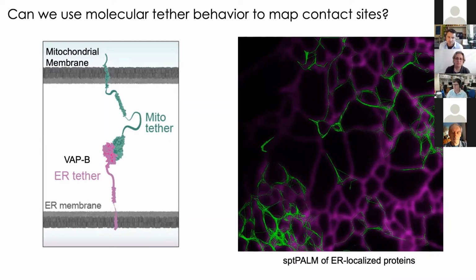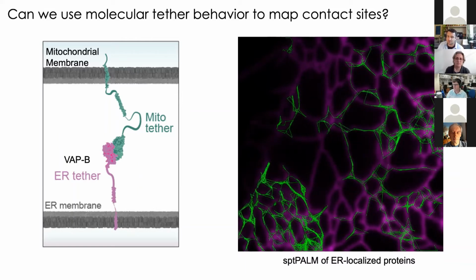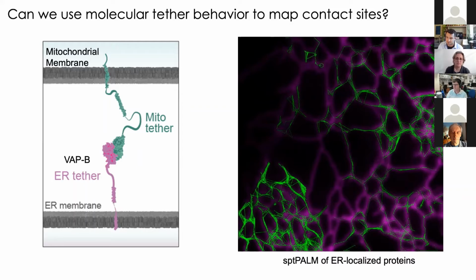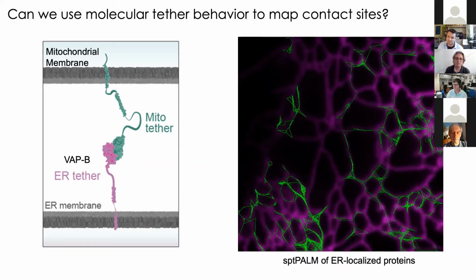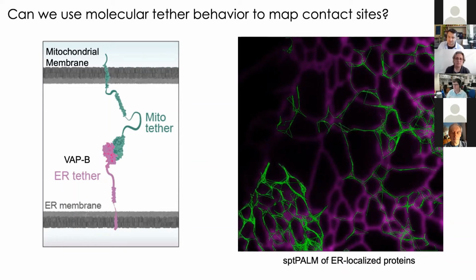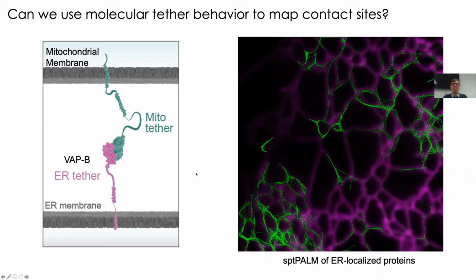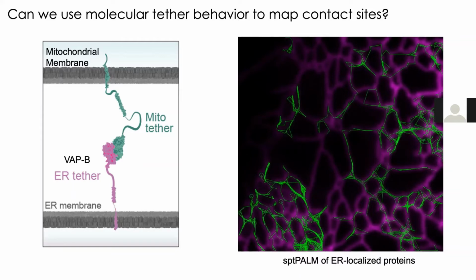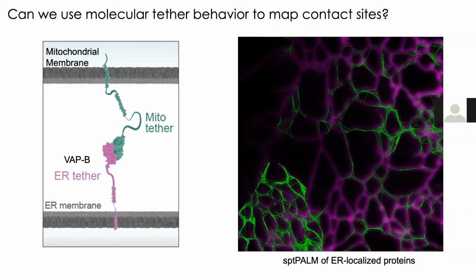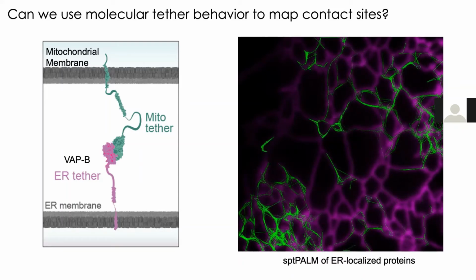We've worked with 3 different theoretical physicists to develop 3 different implementations for how we can appropriately correct the boundary conditions for traditional statistical physics approaches in single particle tracking and pull signal back out of the noise of the system. And thankfully, in giving us confidence in the way that we've done this, all 3 of those qualitatively converge for the vast majority of biological processes, and 2 of them even quantitatively converge for diffusion. And so we have some faith in our ability to pull signal from this.